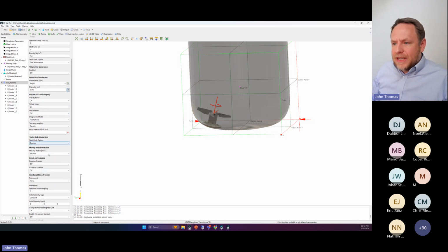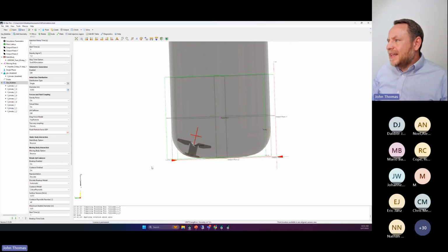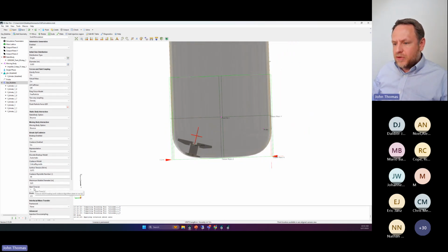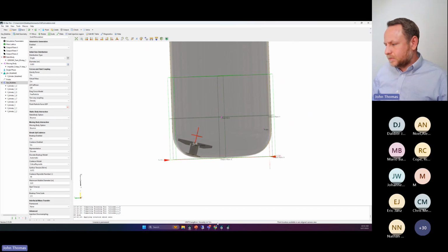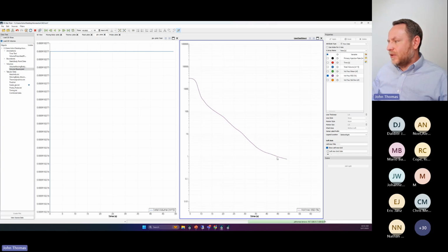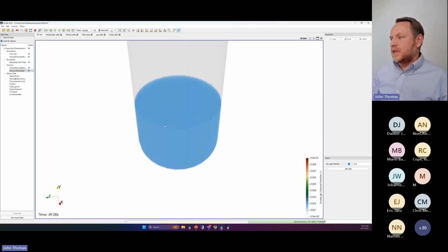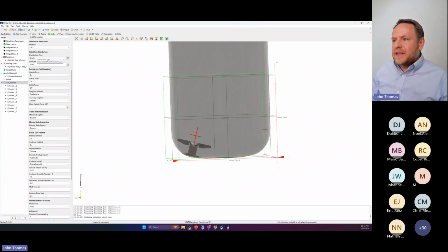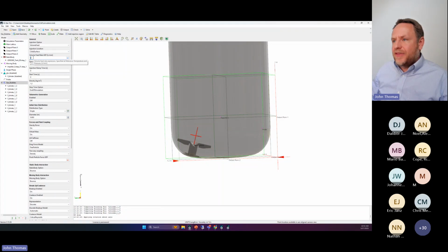I'm going to turn on breakup and coalescence using the built-in models. Just watch this guy go. And let's watch this guy start to spin. I'll have this breakup and coalescence start at time 0, just so we're getting the whole size distribution. Okay, just for those who are still wondering, here we have our mixing. It's starting to settle in. It's getting homogenized. We're at like 99.7% homogenized. This guy's wasted. Okay. Let's now run this simulation with the gas bubbles and the sparge flow.